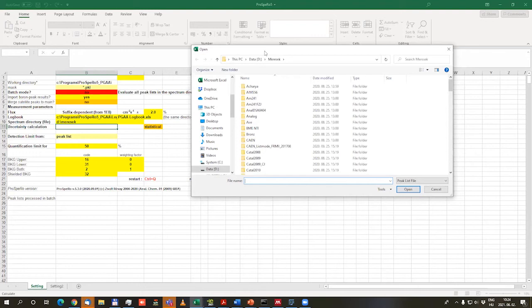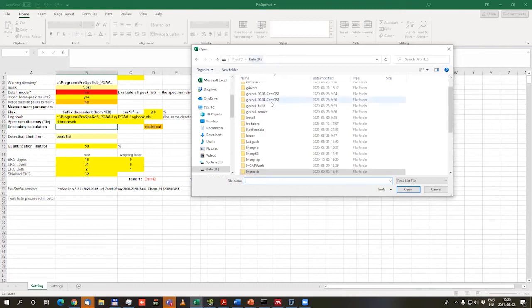So each element which we detect in the sample will have one mass. And then at the final stage, we will consider the concentration of the elements as the ratio of the elemental mass what we detect over the masses of all other elements which were detected in the sample. So we compute directly concentrations instead of masses, which is much more accurate than measuring the masses.